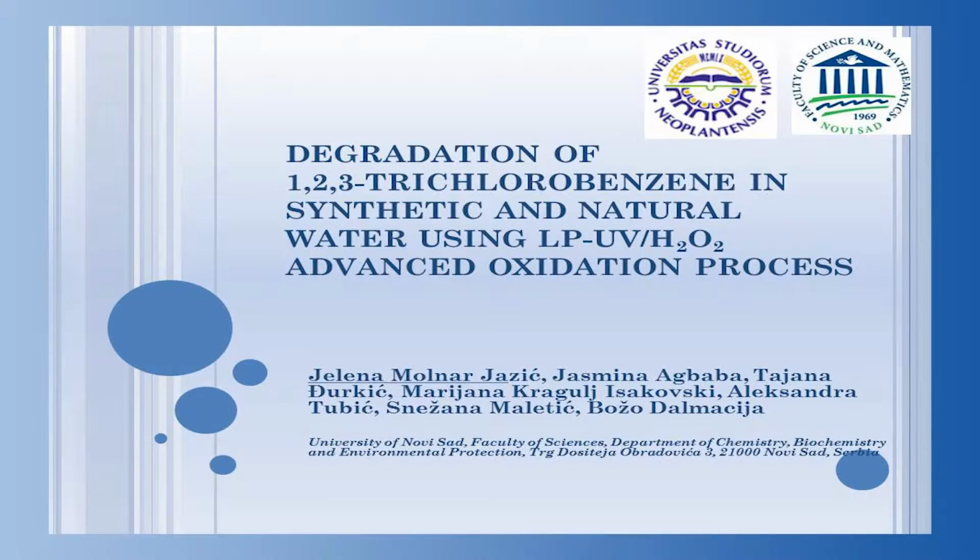Good afternoon. I will continue this section with organic pollutants. Particularly, I will present results of trichlorobenzene degradation in different water matrices using UV photolysis alone and UV combined with the hydrogen peroxide advanced oxidation process.